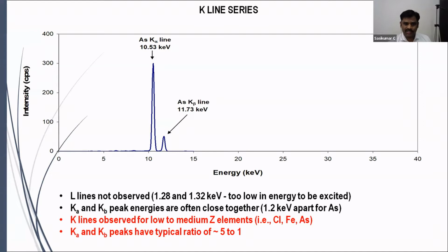Sometimes it may happen, based on your equipment, that the equipment will not be able to resolve such a small energy difference. In fact, the energy difference is very close, so sometimes both peaks will get merged and look like a single peak. So one has to be very careful when you are analyzing, based on your equipment.